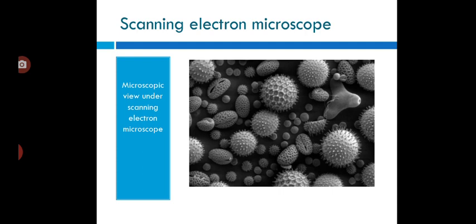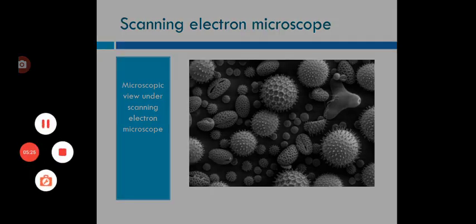A scanning electron microscope can detect and analyze surface fractures, provide information on microstructures, examine surface contaminations, reveal spatial variations in chemical compositions, provide qualitative chemical analysis, and identify crystalline structures. The scanning electron microscope is an essential research tool in fields such as life science, biology, gemology, medical and forensic science, metallurgy. So this is about the scanning electron microscope of electron microscope.